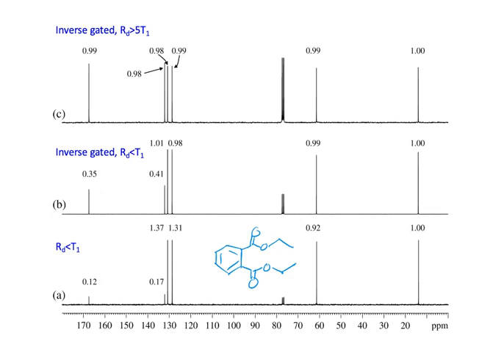But you can add contaminants that way as well if your tubing is not clean or anything else. So I isolated this compound, UV active, everything, and I was all excited, and I went down. I spent all night on the NMR running these selective decoupling experiments and everything because I had a small amount.